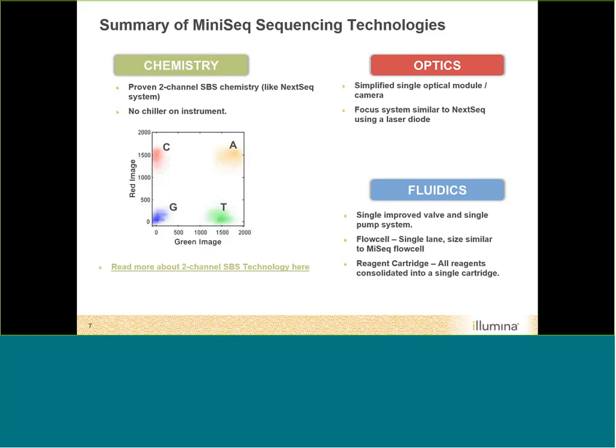The optic system is a single optical module including mirrors, lenses, objective lenses, and the camera — a single camera system. It uses a laser diode focusing system similar to the NextSeq. The fluidics uses a single improved valve and single pump system. The flow cell has a single lane with geometry very similar to the MiSeq flow cell. The reagent cartridge is one large cartridge containing all reagents needed for a run, including your sample loading position, enzymes, buffers for SBS chemistry, and all primers needed to support dual indexing.